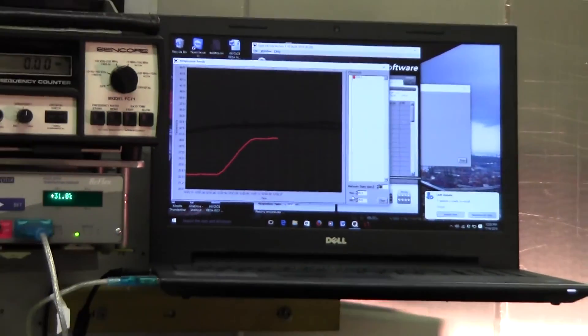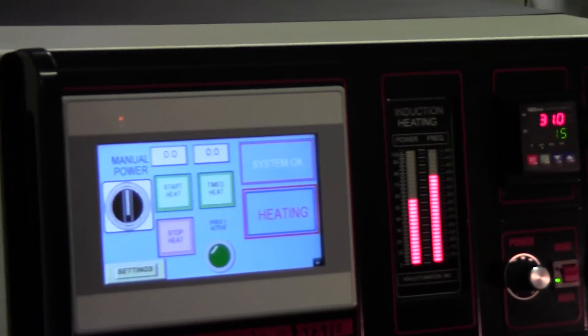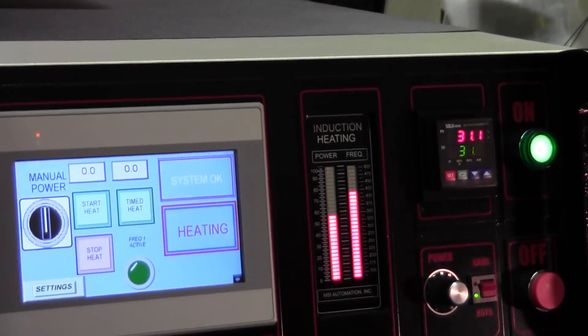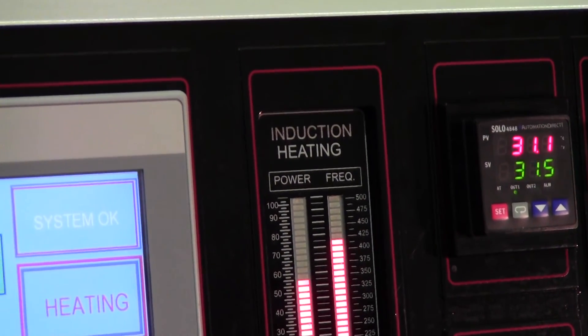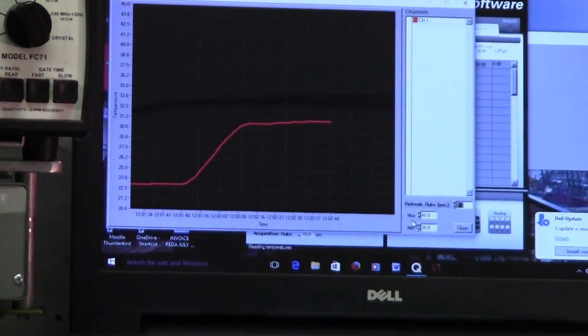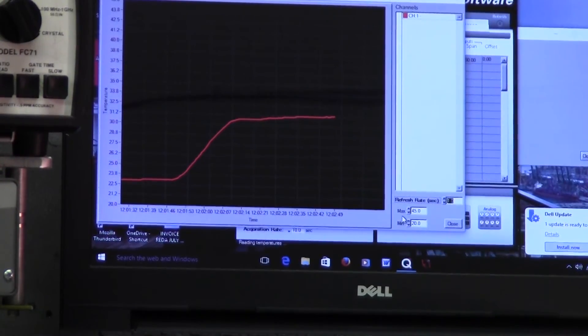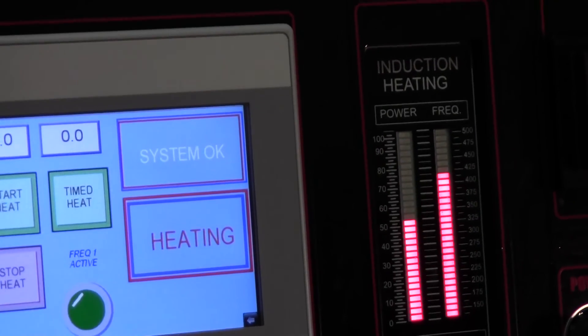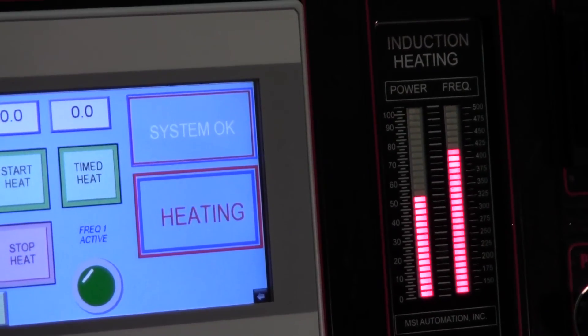Go back over here. I don't know if you can read that. 31 point, 31.1, 31.5. It's almost level. And as you can see from the power meter, the power meter has come down automatically and it's holding at maybe 50% power to maintain that temperature.